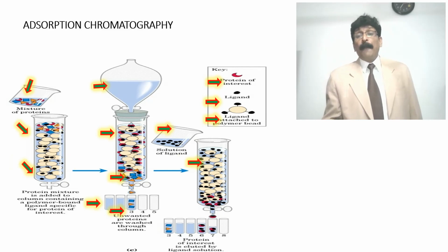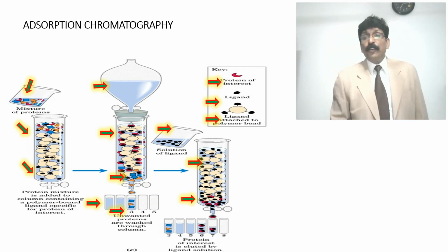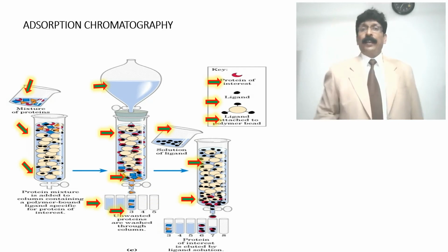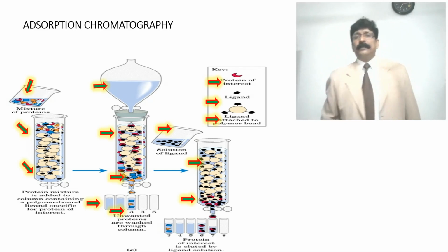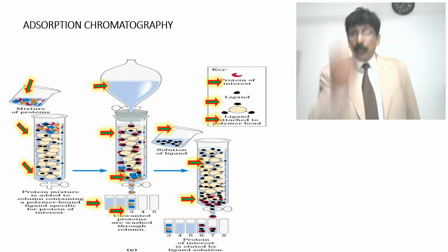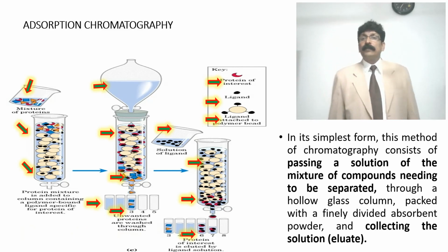So what will happen? This ligand, the dotted, you can see, it is a picture only to show you the color, just to know, okay, ligand solution. Ligand solution, when you are adding, what will it do? It will bring all the interested protein, the required protein, the red color moon shaped protein, which makes the complex with the ligand, which has more affinity towards the mobile phase, and it can be separated as shown in the picture. So this is how the separation takes place.